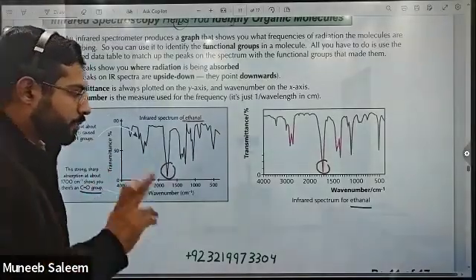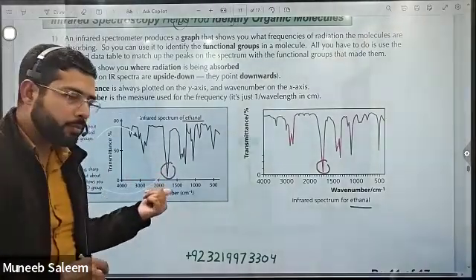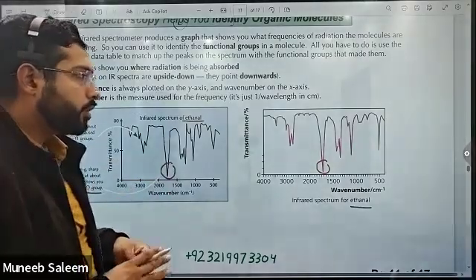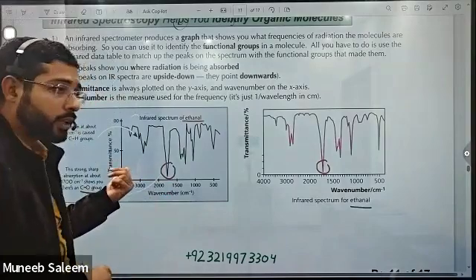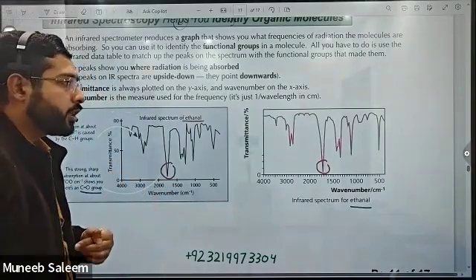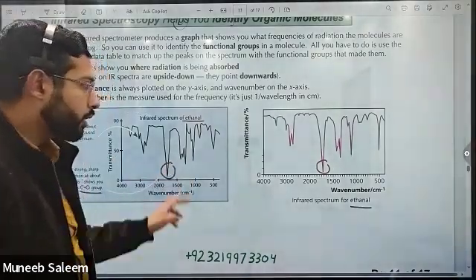Just because it has only the intense peak of the carbonyl bond in this range, we might consider that it should be the carboxylic acid, but it does not contain the OH group here. If we consider that it must be an ester, then it does not contain the CO bond here, neither here.